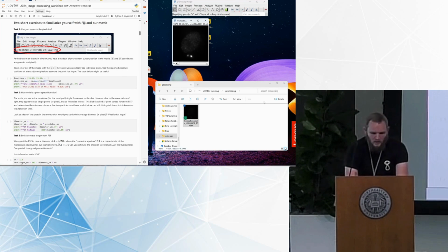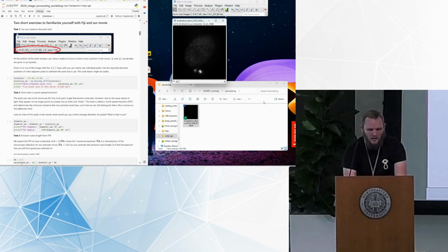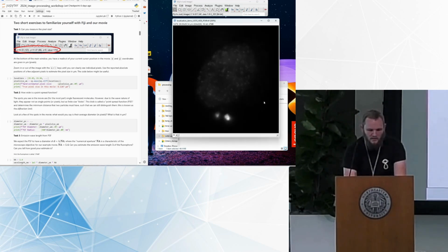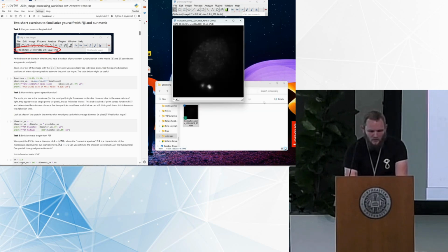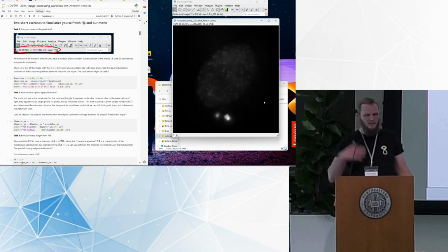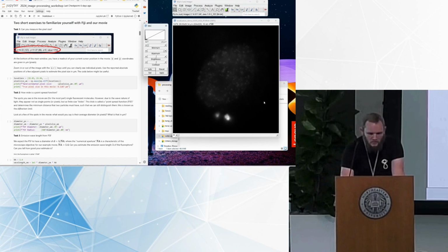You can zoom in by pressing plus and zoom out by pressing minus. In the first steps, it will increase the size of the image. If you zoom further, it zooms in. So now this movie still looks kind of dark, right? We don't have proper contrast. So you can press Control-Shift-C, or alternatively go to Image.